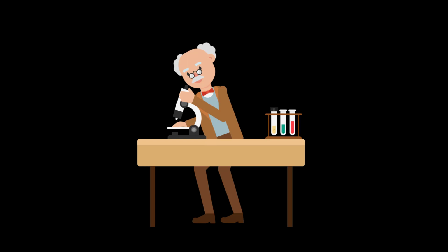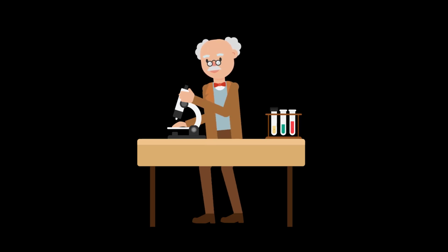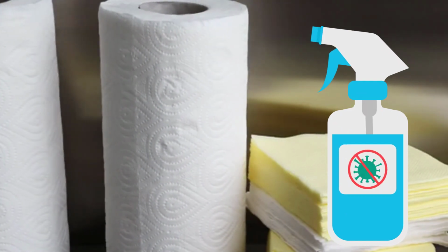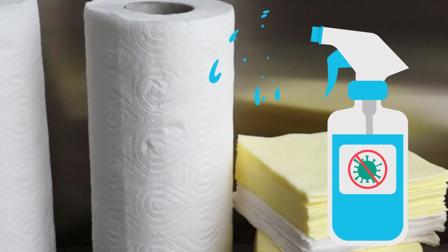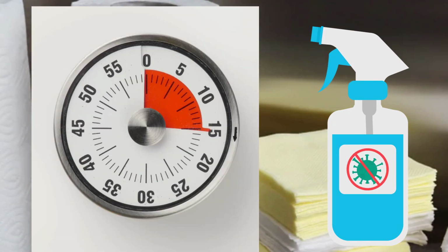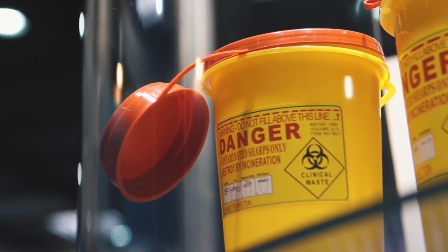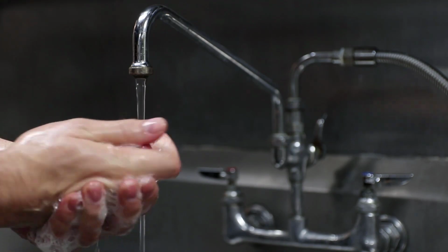If you should spill or drop a culture, or if any type of accident occurs, call the instructor over immediately. Place a paper towel over any spill and pour disinfectant over the towel. Let the disinfectant stand for 15 minutes, then clean the spill with fresh paper towels. Discard these paper towels in the proper receptacle and wash your hands carefully.